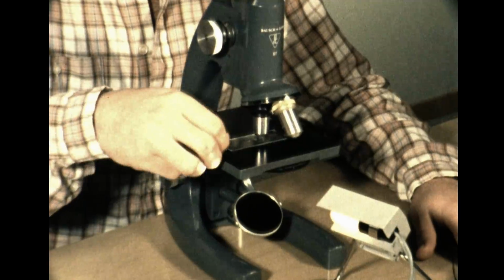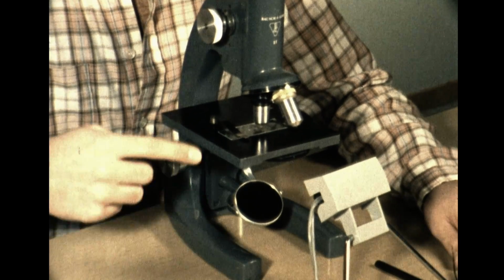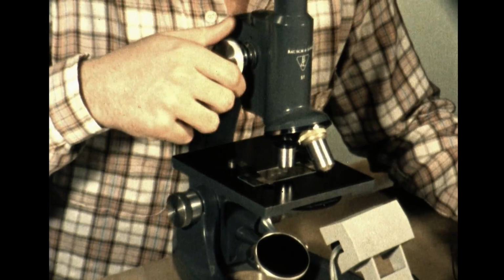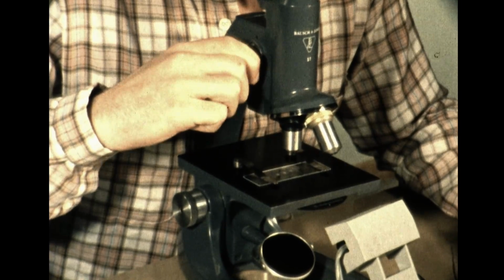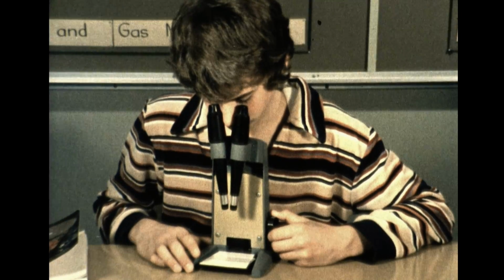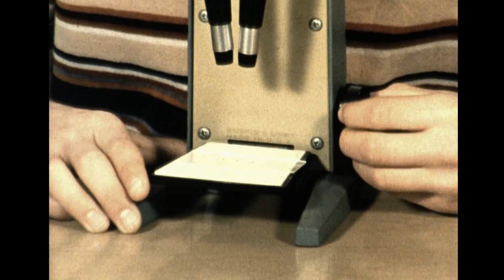Samples to be examined must be transparent or translucent. The light from the source, reflected by the mirror, must shine through the specimen that is placed on a glass slide. The focusing is achieved by two focus knobs which move the lens system up and down in the body tube. There is a coarse focus, usually the larger knob, and a fine focus, usually the smaller knob. Other microscopes have static lens systems. In this case, the stage is moving up and down to focus on an opaque sample.